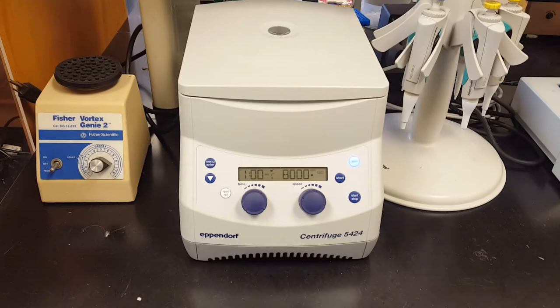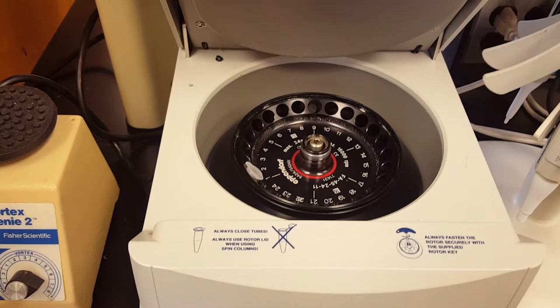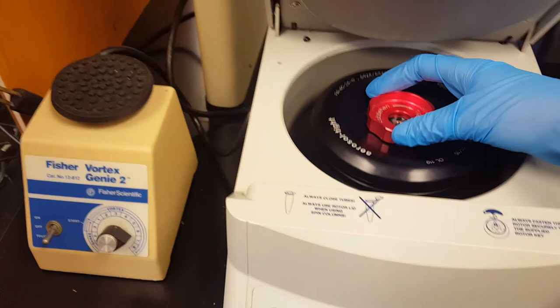And finally we have our centrifuge. This is used to separate out the liquid in our samples according to density. When we open it up you can see that it has a rotor in the center and this is what actually spins around super fast. The tubes fit into this rotor, and then we place the cap back on and close it down. On the front we can set the speed at which we want to spin our samples and then for how long.